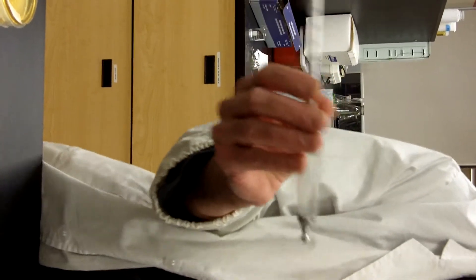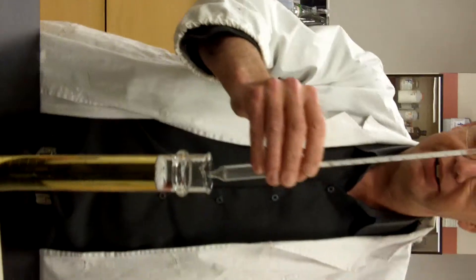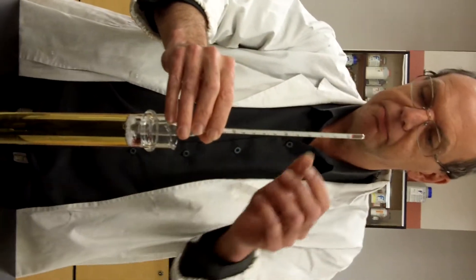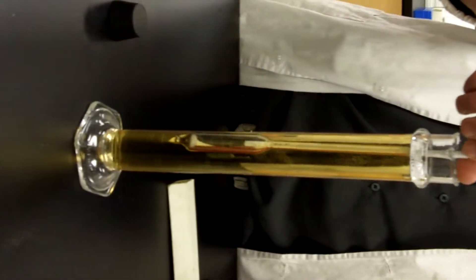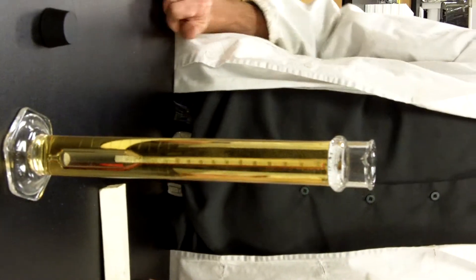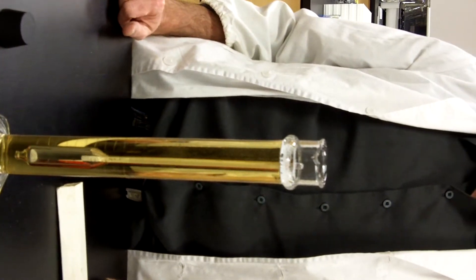So when you're actually placing the hydrometer in the beer, you essentially lower it down. You don't just plonk it down. And you give it a nice little spin. And the spin just to get rid of those residual bubbles.